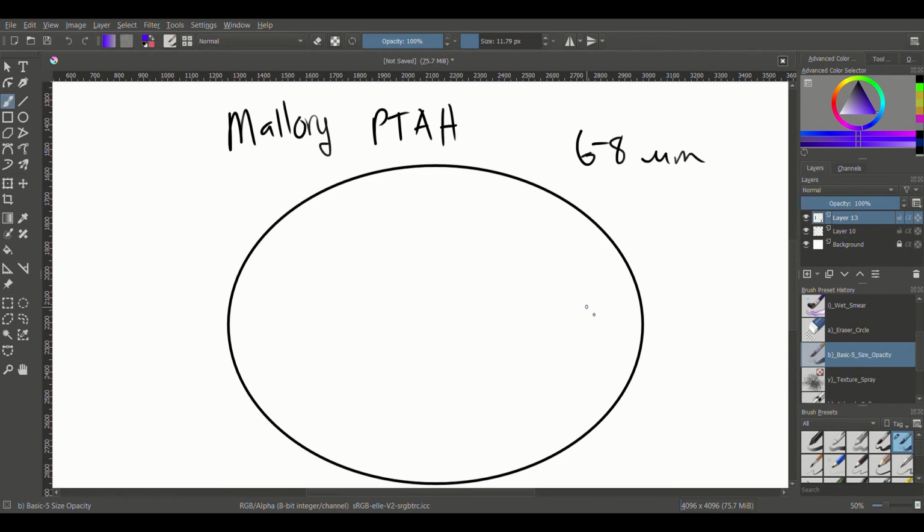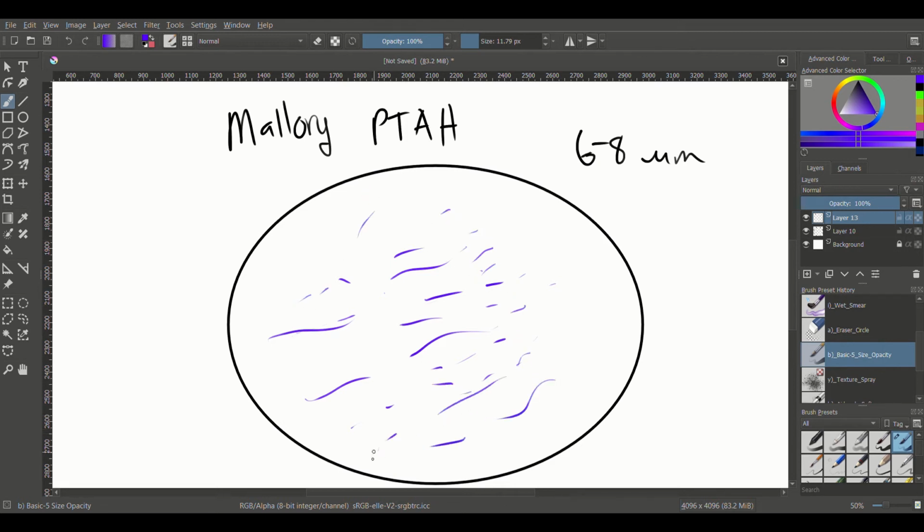And after that, everything should look as though the glial fibers are going to be blue. So if you have any kind of glial fibers, which will typically run next to your actual axons, those will be blue, as will myelin. So you see a lot of these of varying widths, because all those fibers are the same color.